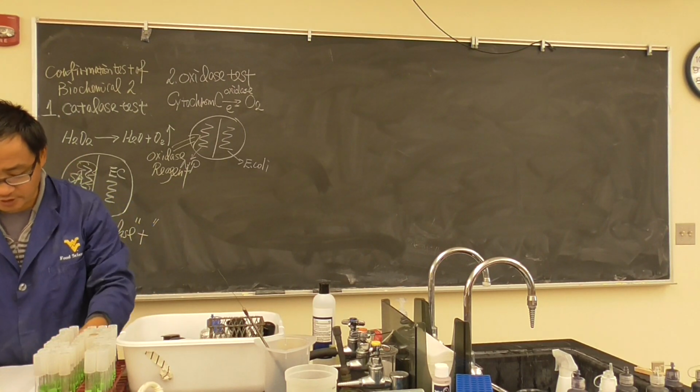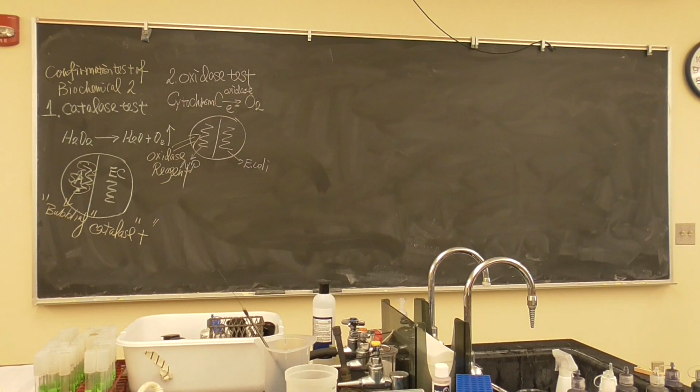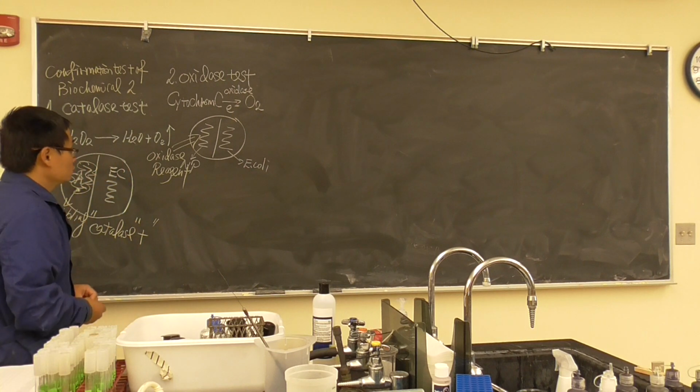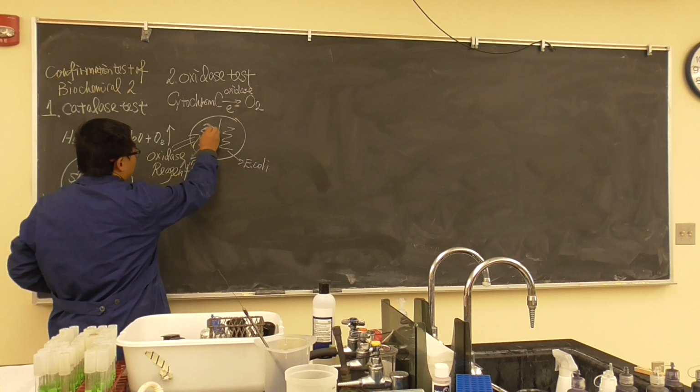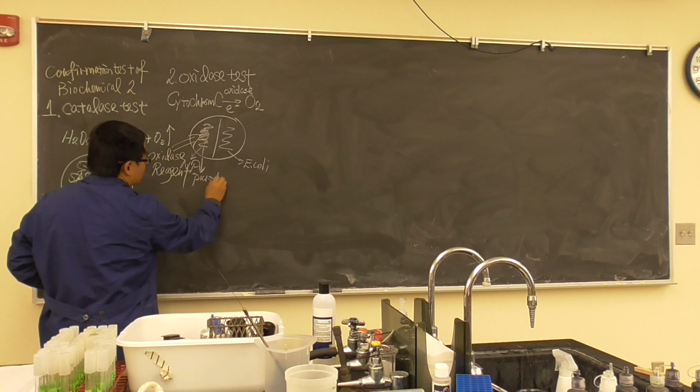So the same thing here. Ian, can you go ahead and drop on every plate, including yourself, for this half batch? What you're going to see is, on the Neisseria part, a purple color showing up.